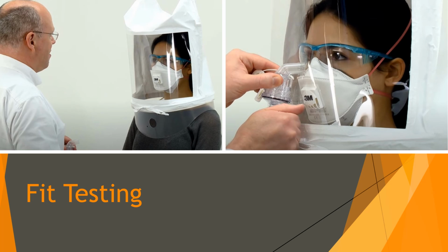Okay, now we're going to move into fit testing. The aim of this is to be able to find you 1 to 2 masks which fit your face well and provide you with the best protection. It is an assurance that the mask you are wearing is working correctly and protecting you. We'll use a hood, as you can see in this picture, and spray a fine mist of either a sweet or a bitter tasting solution. With a well-fitted mask, you'll be unable to taste the solution at the end of the test.